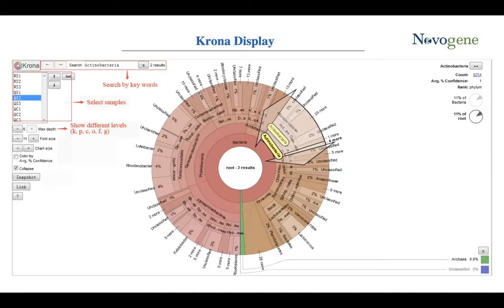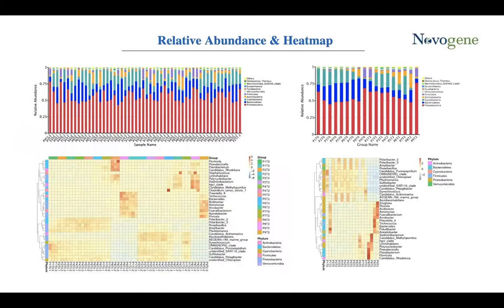And also, according to the taxonomic annotation results, we select the top 10 taxa of each sample or group at each taxonomic rank, that is phylum, class, order, family, or genus, to form the distribution histogram of the relative abundance of the taxa. So we can visually see the taxa with higher relative abundance and their proportion in different classification levels of each sample. And the relative abundance of taxa in the phylum is illustrated in these figures above.